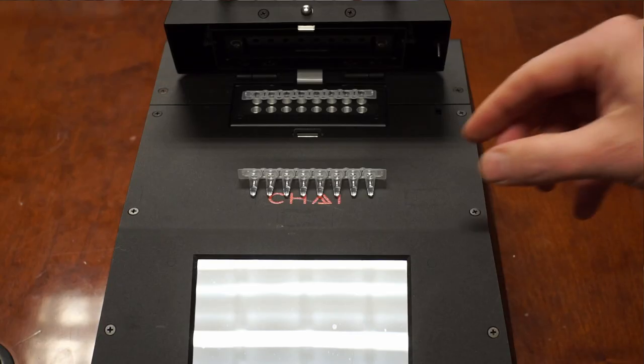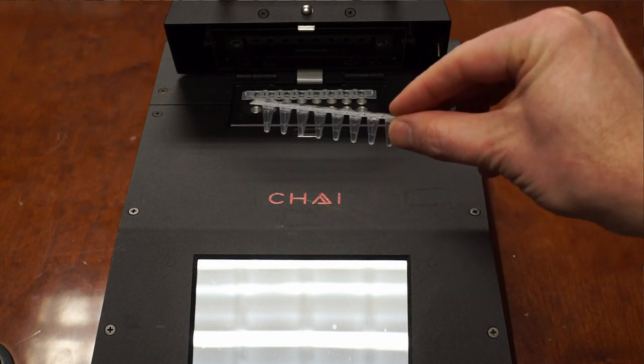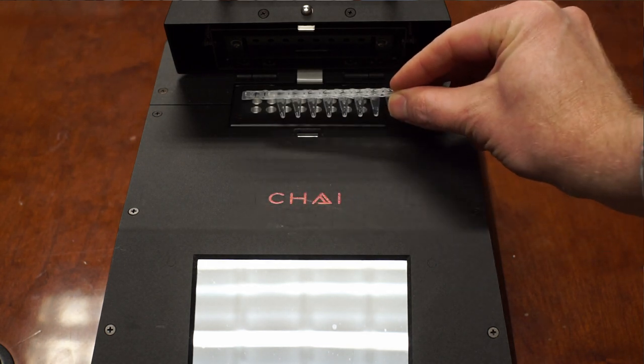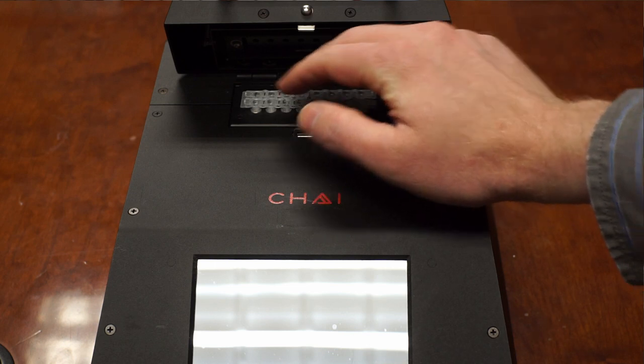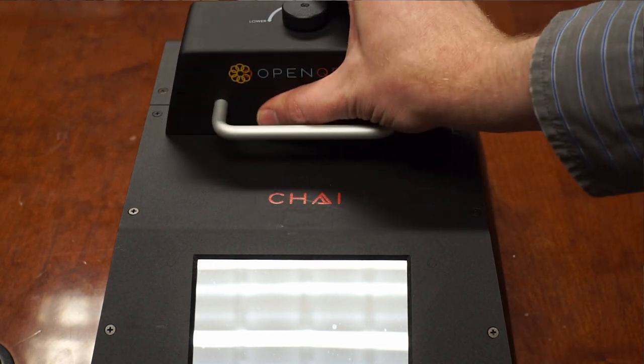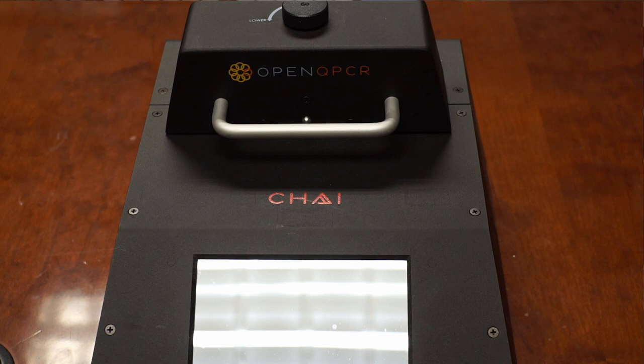There's another level on top of this though. You can use an instrument called, in this case, a real-time PCR or a quantitative PCR, RT-PCR or QPCR. This is the instrument I have. It's an open source, open QPCR. It does 16 samples at a time. The commercial large-scale instruments can do 96 or even 384 samples in one run, which makes them better for clinical testing. This instrument works the same way.